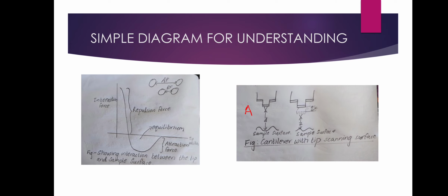The reflected ray of different intensity and angle is being collected in the photodiode. So this is the working of the atomic force microscopy.